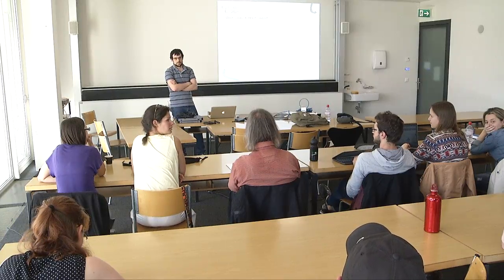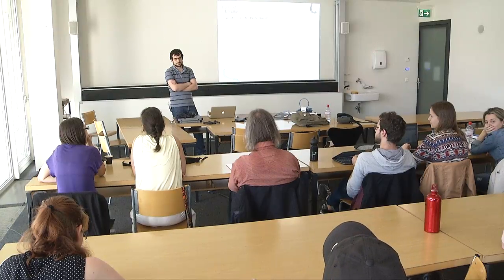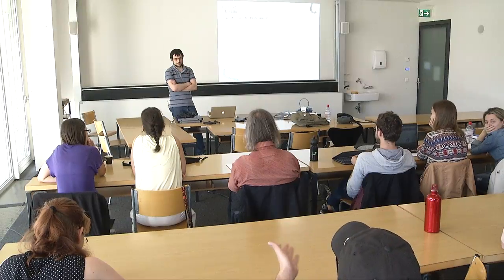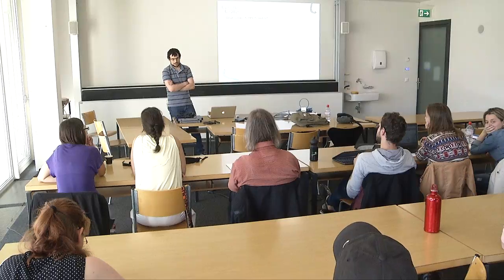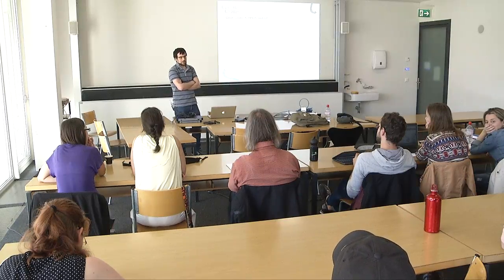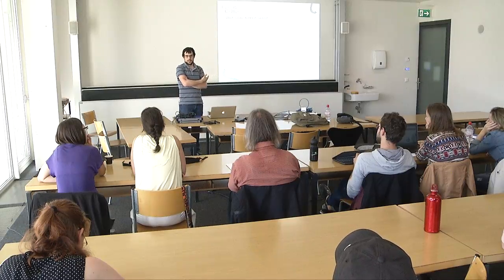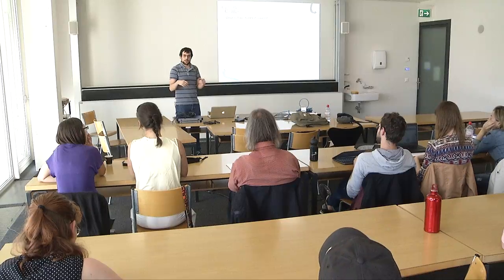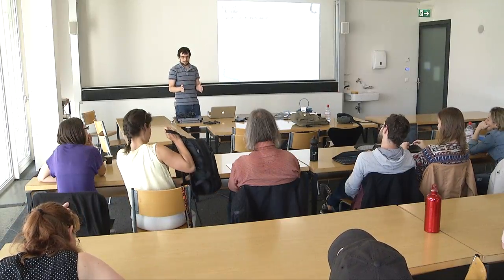Regarding analysis, DDA is not targeted. SWATH and MRM are targeted because you're really interested in which peptides; you basically only analyze those peptides you're interested in. This is how I perceive the situation. But for example, for SWATH analysis with DIA-Umpire, you have everything there, and you can ask to extract all the information that you have.